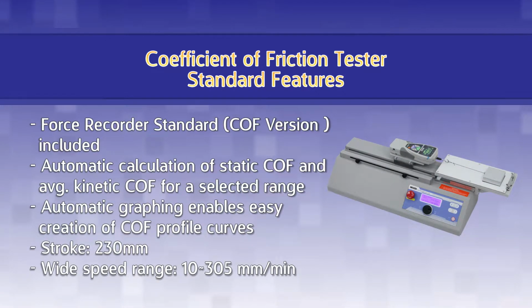Force Recorder Standard COF version is included with the COF Tester. The software includes automatic calculation of static COF and average kinetic COF for a selected range. Automatic graphing enables easy creation of COF profile curves with start and stop triggers.